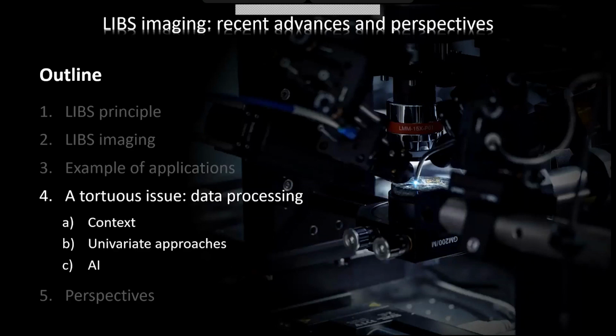Okay, so now I'm going to the next part, which is a very nice part, honestly. Imagine that you have an equipment that is doing hyperspectral imaging. So you make an image, and for each pixel of your image, you have a full spectrum. And imagine you have, for example, 10 million spectra, a big file that is half a terabyte.